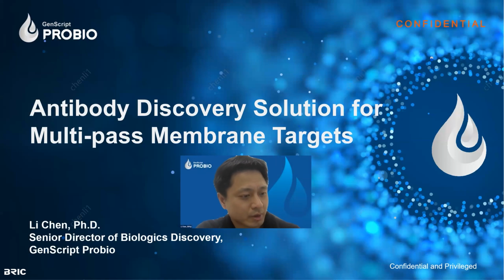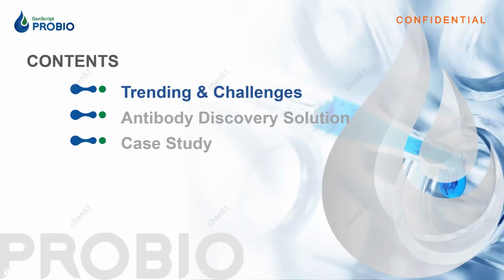As the host introduced, we will have a discussion about the antibody discovery strategy against multiple pass membrane targets. For starters, I will give a really brief overview regarding the current trends and the challenges in the field of antibody discovery against multiple pass membrane proteins. Then we will spend a little more time on the technical solutions regarding this particular application. At the end, we will share a case study of antibody discovery against CCR8, a really popular immune modulating target over the last couple of years.